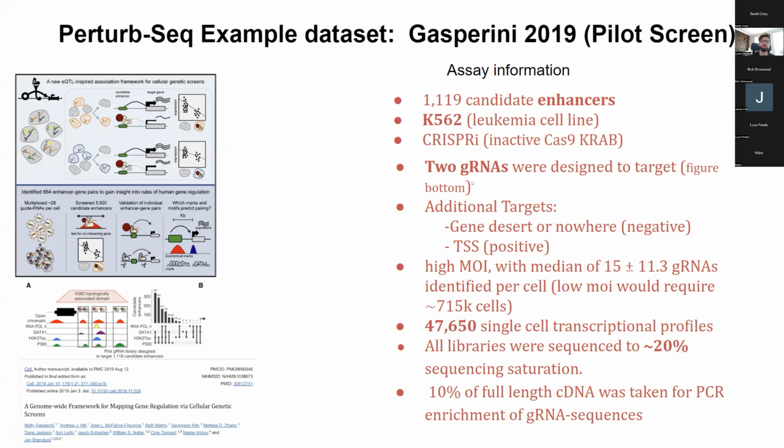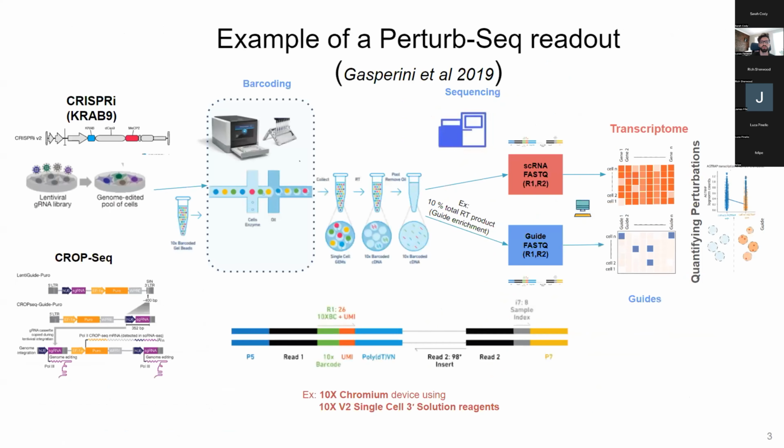They have guide RNAs and the Cas9 CRISPRi system, and they check the neighbor genes to see which genes are affected by the guide's presence. It's public, and a lot of tools already use it as a benchmark. We have this end-to-end pipeline that we're going to show today that tries to analyze this data and provide results similar to the final paper.